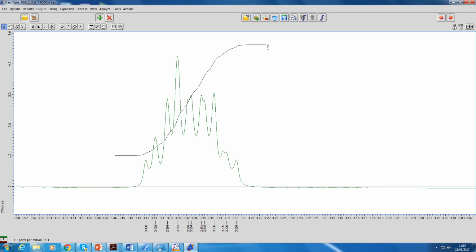And I mean, if you want to export these files, probably the most convenient way actually is using screen dump. So just print screen, and then that's one way of getting the data off. Before you do that, you might want to zoom in, probably on a level where the peaks are above each other quite nicely. So you can use zoom.